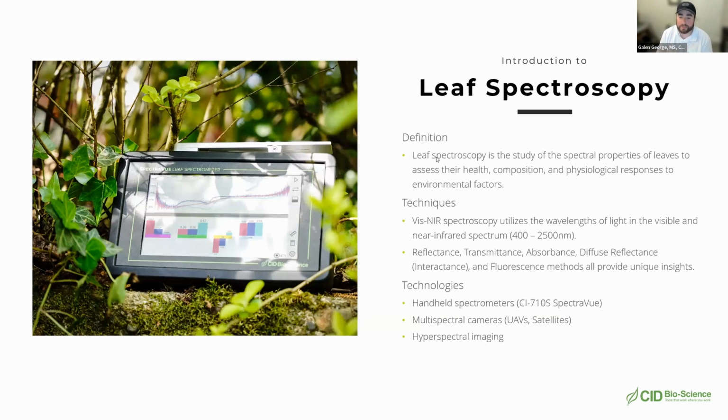We have indices for nitrogen, phosphorus, and potassium that give you a unitless measure you can use for comparison against other plants in different treatments or conditions. They are not direct quantitation indices, so right now there are no crops for which you can get direct nutrient content quantitations out of the box.